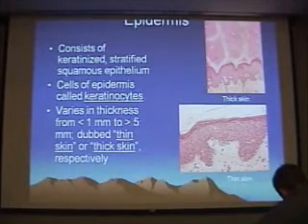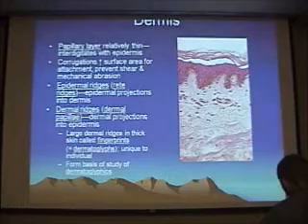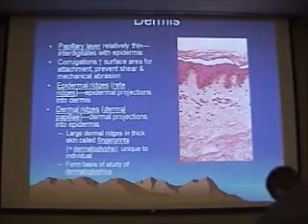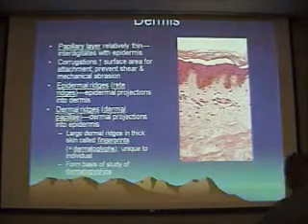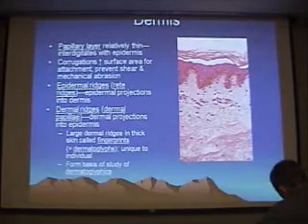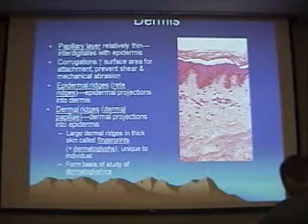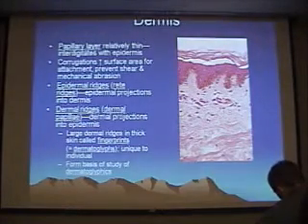Melanocytes themselves don't stain well, but they produce melanin that is picked up by the surrounding cells. All this granular brown stuff is melanin, produced by melanocytes — you can see cells with a little halo around them that are probably melanocytes. A cell with a halo further up in the stratum spinosum is most likely a Langerhans cell. Notice the dermo-epidermal junction is corrugated — we have epidermal ridges, also known as rete ridges, and dermal ridges, also known as dermal papillae, which add strength to the skin and prevent the epidermis from sliding off.